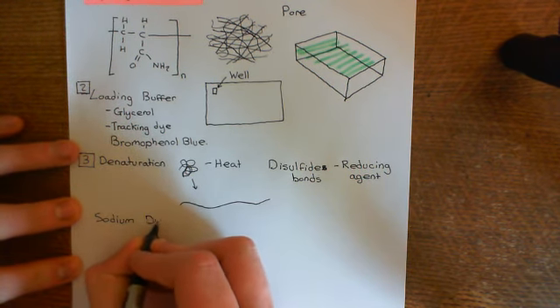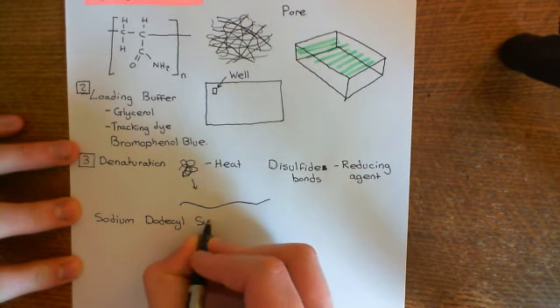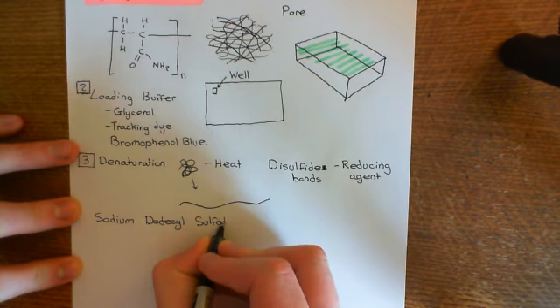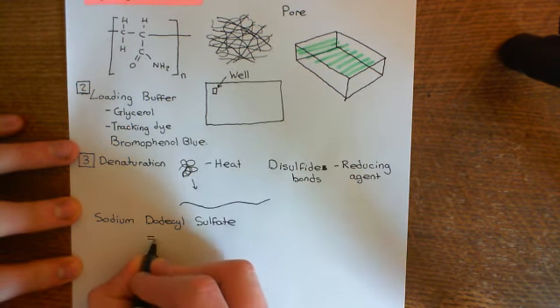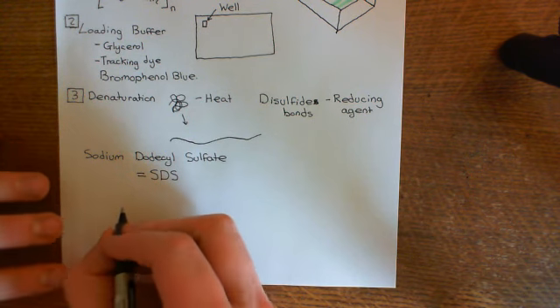For short, sodium dodecyl sulfate is often abbreviated to SDS, for sodium dodecyl sulfate. Let me show you the structure of this molecule, because its structure is quite important for understanding what this molecule is actually going to do. Basically, sodium dodecyl sulfate is a detergent.